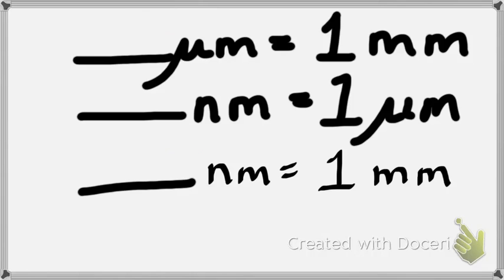Do you see the funny-looking UM that's there? Okay, so that is also a metric unit of length, because the M stands for meter. What they wanted was a unit they could use to measure things under the microscope, and they, like us, found that millimeters were too big. One day, we put a ruler on the microscope, and we found out that when you go to high power, the field of view was only half of a millimeter. So you couldn't even see the ruler. Y'all remember we couldn't even find the ruler lines when we tried to look at the ruler on high power. Millimeters are just too big.